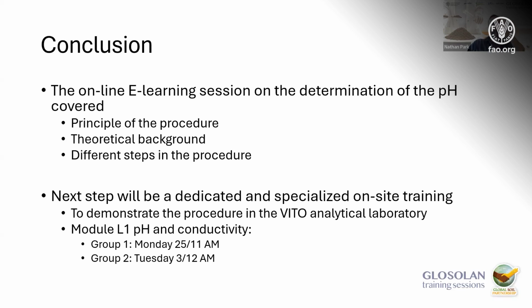Yeah, I feel like pH is probably one of the more simple analyses to conduct, but probably the most important parameter impacting all sorts of things, like contaminants, metal uptake, fertility. Indeed. I think in the soil sample, the pH together with the total organic carbon content are two important parameters in the soil health aspects. Okay. Any other questions from anybody, or are we good?